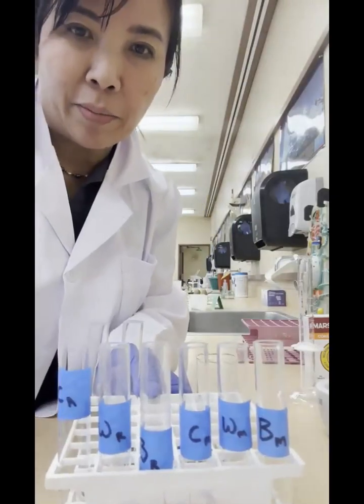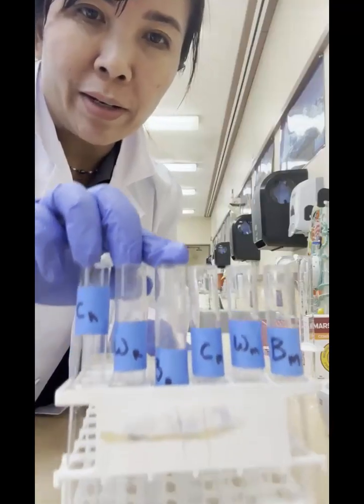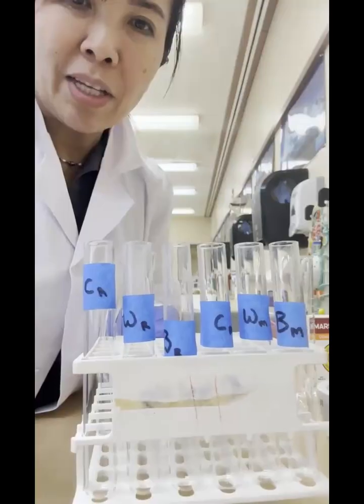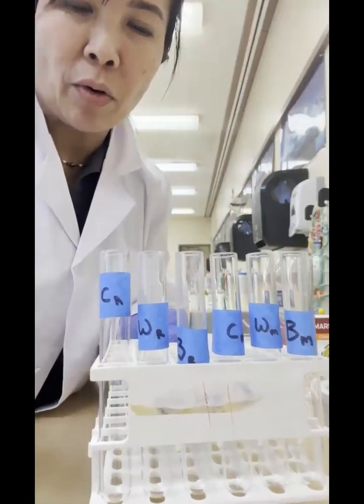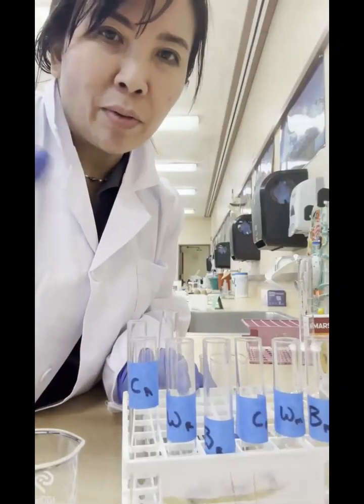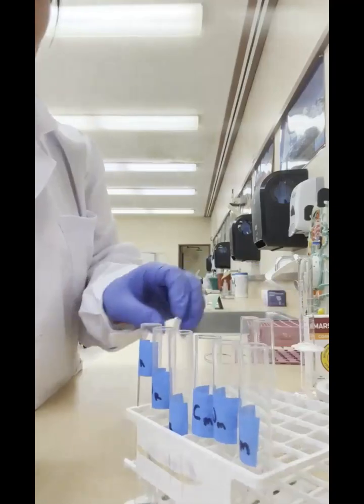We have 6 test tubes set up here. These 3 will be for my rennin, and these 3 right here will be for my milk. So I'm going to add roughly 1 inch worth, basically 1 knuckle worth. It's going to be roughly 2 to 3 milliliters, and I'm going to add it to the test tubes accordingly.